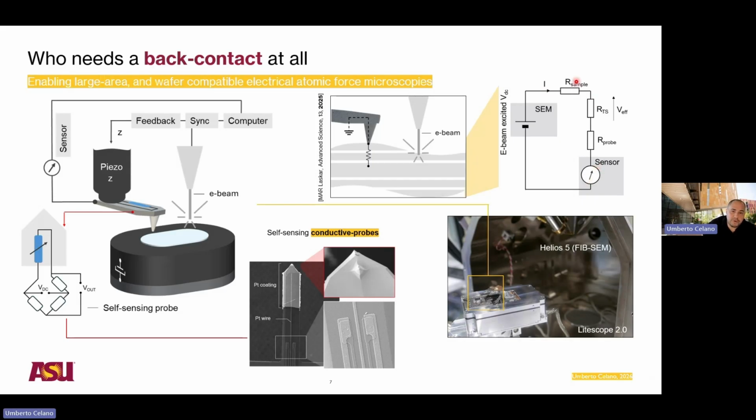So we have an intrinsic sheet resistance imposed by the material, which is in between the beam and the probe. Some kind of probe-tip-sample junction that depends a lot on the material of the probe and on the samples you are studying, and of course a little bit of static resistance imposed by the material you are selecting for your probe. And finally a sort of conductance meter, in this case a sensor that, if we want to implement C-AFM, is nothing else than a transimpedance amplifier measuring linearly the amount of current flowing in the tip-sample junction.